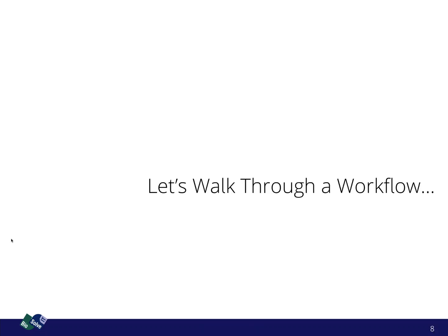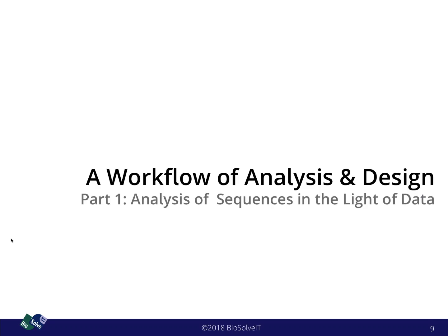Okay, let's walk through a workflow now with PepSee. I split this up in three parts, essentially a workflow of analysis and design. And let's first look at how we get in sequences and data alongside and how we can actually work with that.